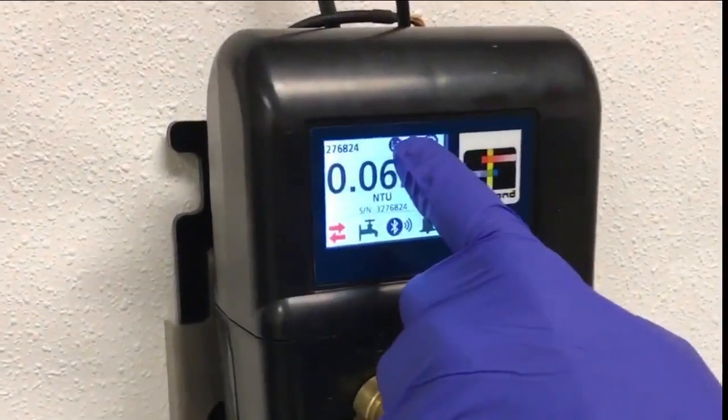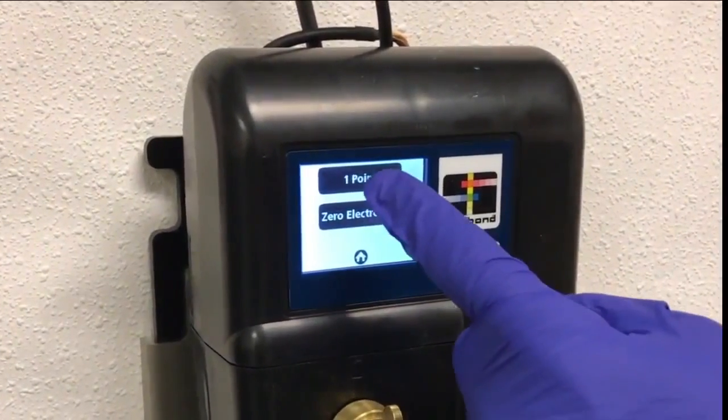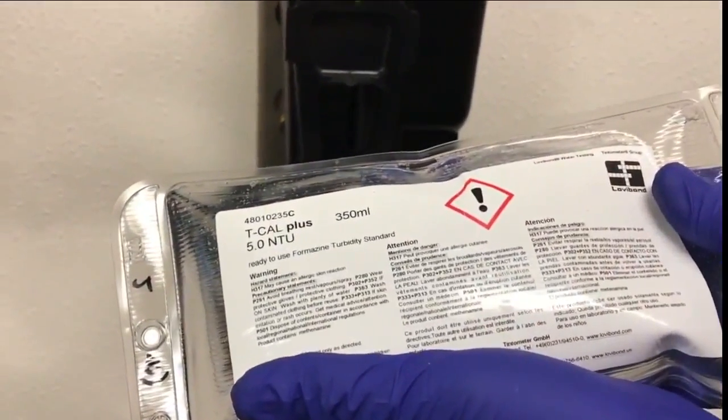To begin a calibration, press the calibration button on the PTV's touch screen. Then, press the one point button to begin a one point calibration. In this example, a TCAL Plus 5 NTU standard is being used.